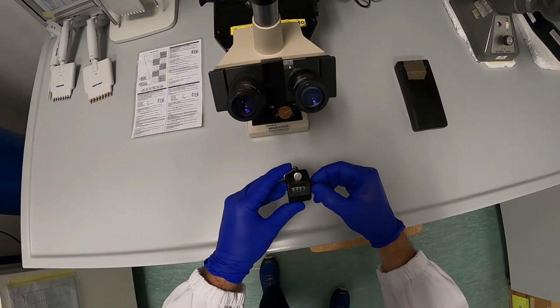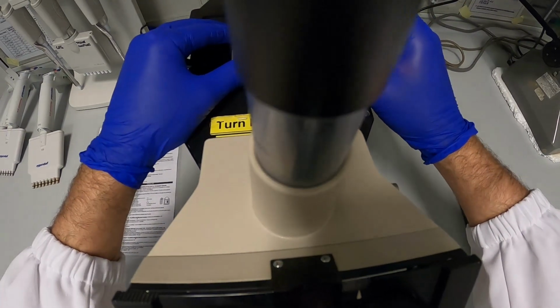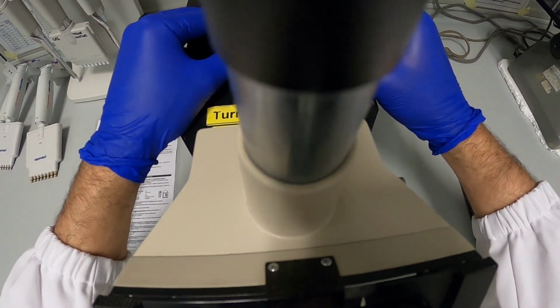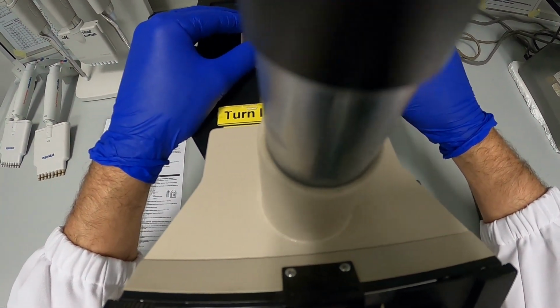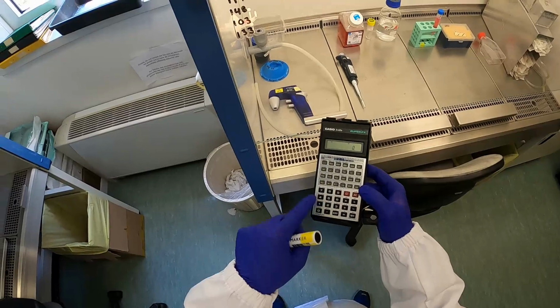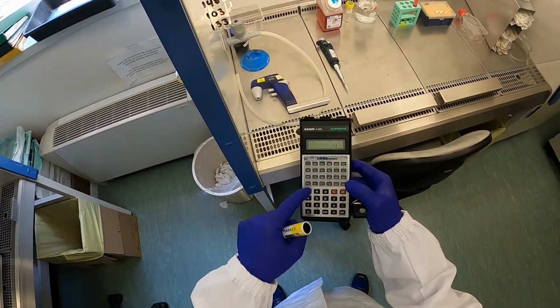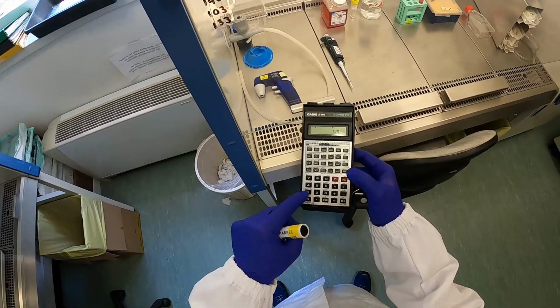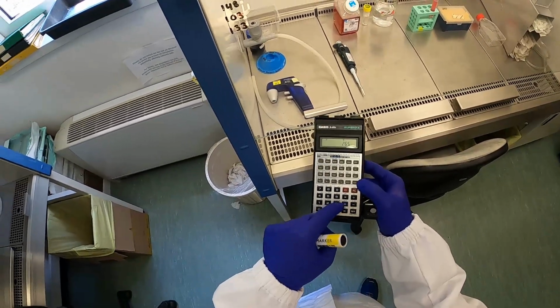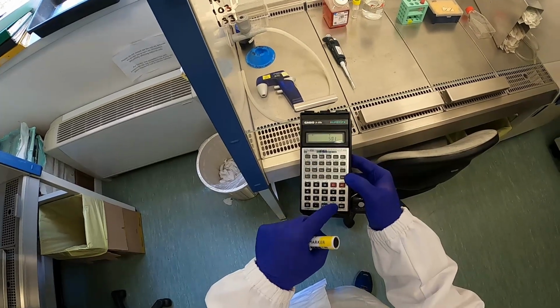So reset your counter and move to a different corner of the grid. Alright, you're already finished. You counted 4 corners, and what you counted was 117, 148, 103 and 133. So just take the average of that.